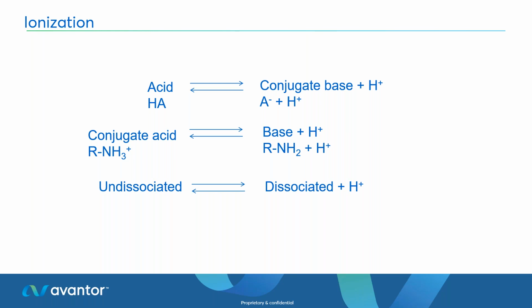So it's best for us to work with the analytes in their non-charged form. If we can't do that, then it's best that they're just in one form, not in this equilibrium that's very close to the pKa, for example. Because in theory, if you've got some part of your analyte, some of your analytes are charged, some are not charged, then you will have two peaks. In reality, what happens is this is in equilibrium, so you don't get two peaks, you get a large, broad, wide, often tailed peak.